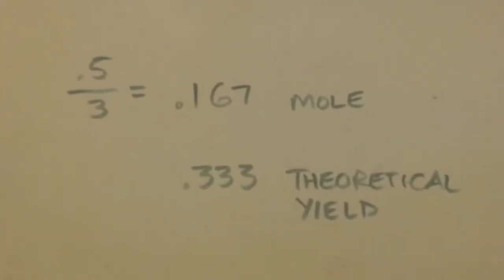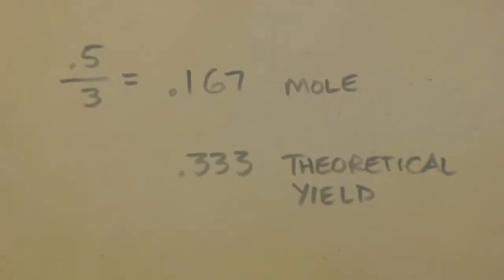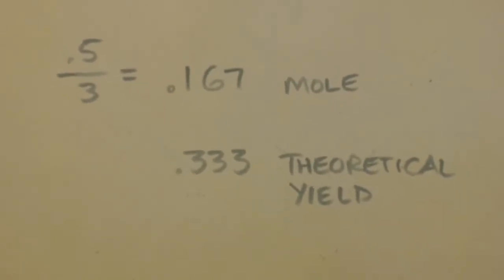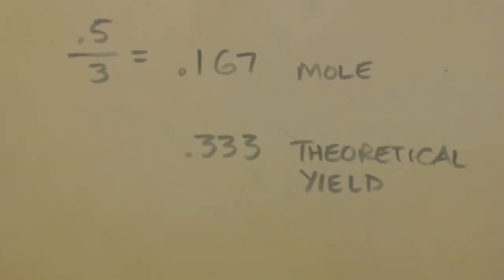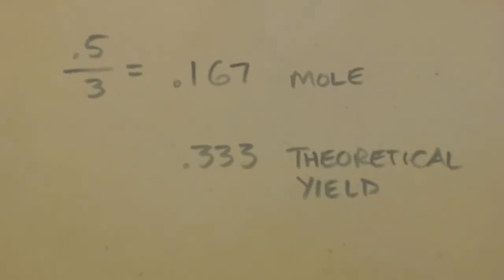I still don't know. I can't remember what I put into that flask, because in my mind I was thinking 1-to-1 ratio, and as you can see from the equation, it's a 2-to-1 ratio. So I guess when I do it again, we'll see and know then.